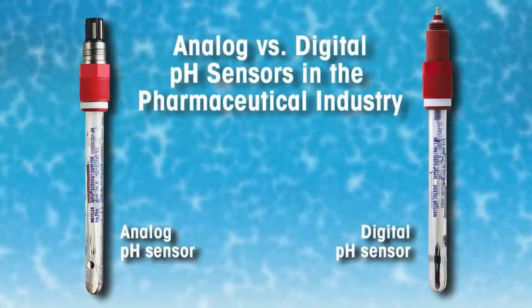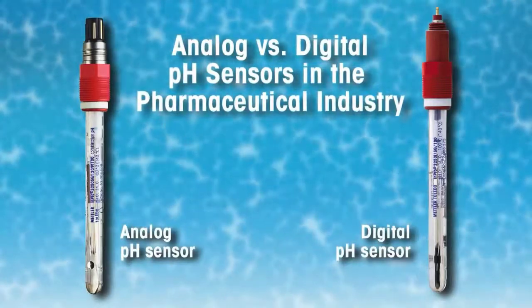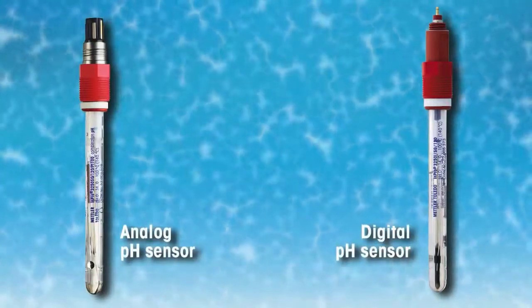In this video we will show you different procedures in the use of analog and digital pH sensors.